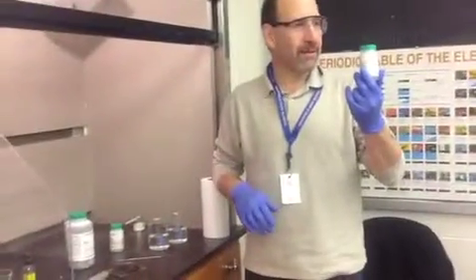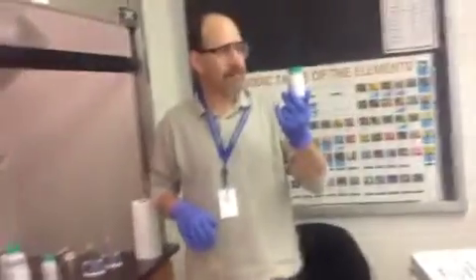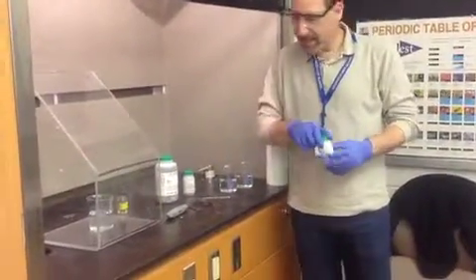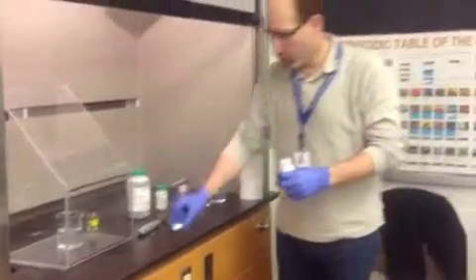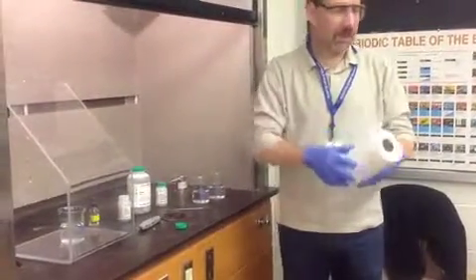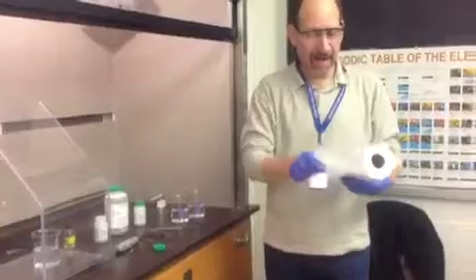Very first member of that family is lithium. I have sodium and I have potassium. Now these guys have to be stored in oil. The reason they're stored in oil is because they are extremely reactive.